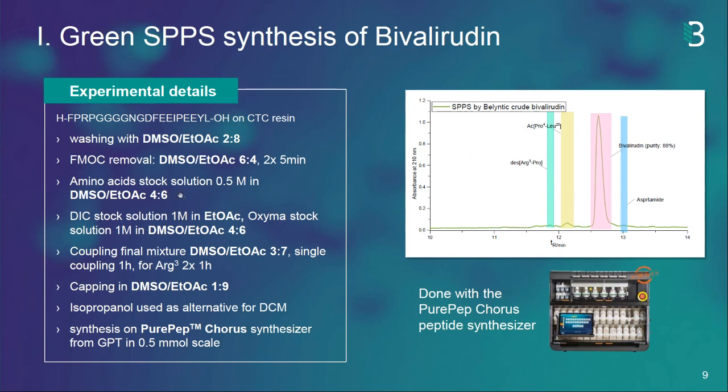0.5 molar, compared to the reported methods. The reason is we are forced to use a high polarity solvent here, compared to the previously reported 2:8. The reason is that only DMSO 4:6 can solubilize highly concentrated, high polarity amino acids.